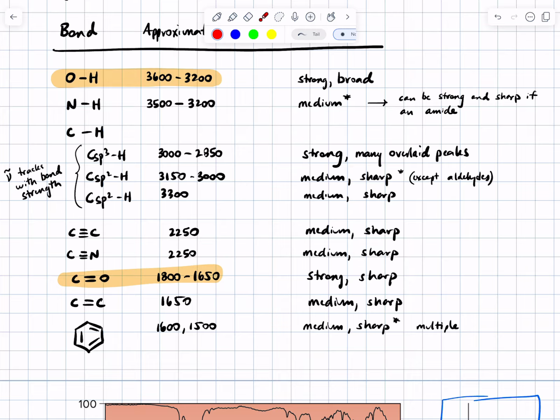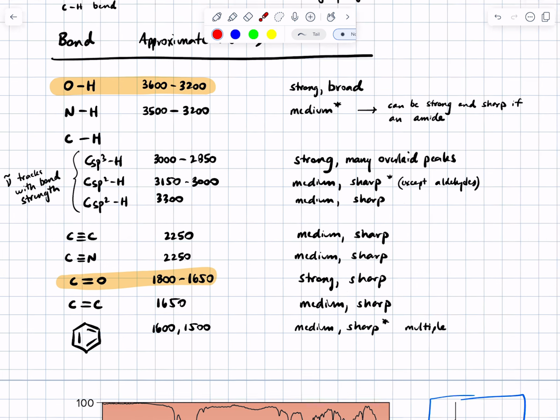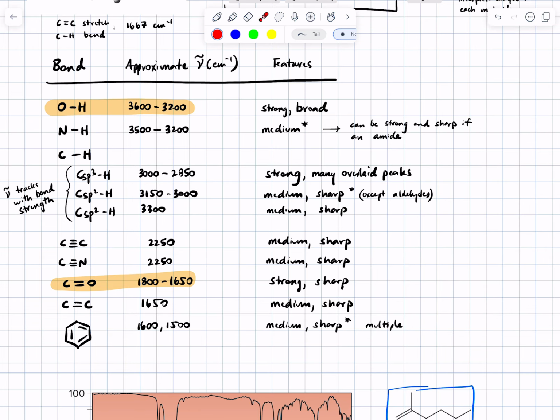The reason for this is that we have other tools for really getting in there and figuring out what all the sigma bonds are and what the connectivity is. So people don't use IR to get the right structure of the molecule. They do use IR to interpret functional group changes in a reaction. So just to review, you will see OH bonds in really high wave number. And this is a range of values. You're not meant to have a specific value here, just a range of values.